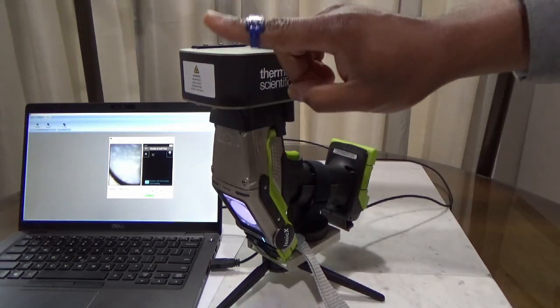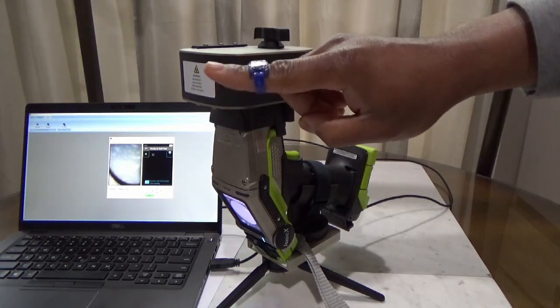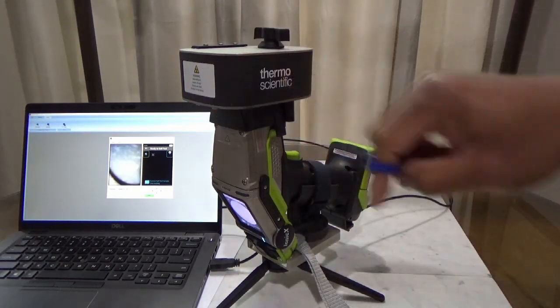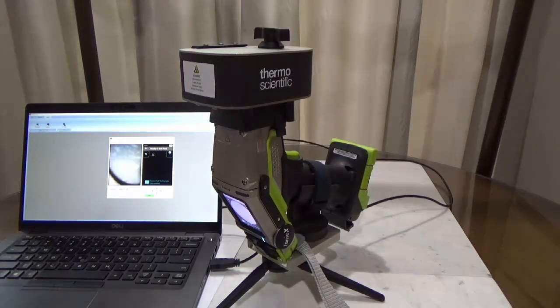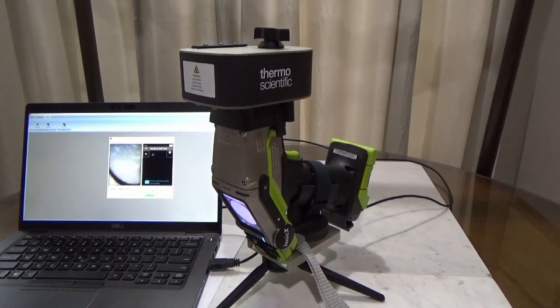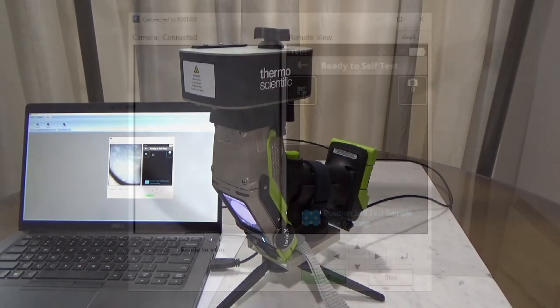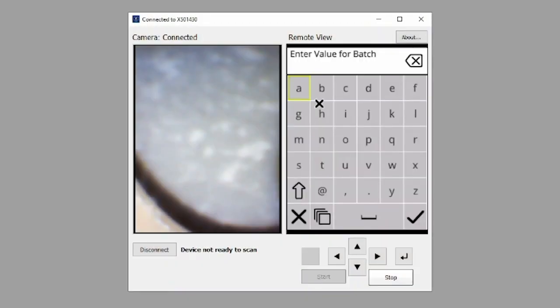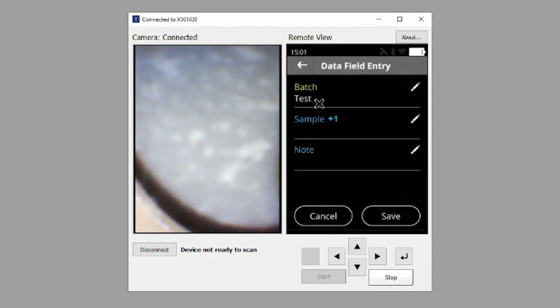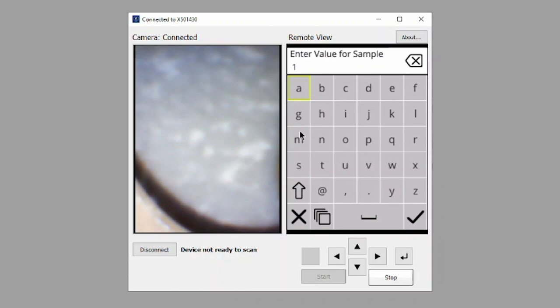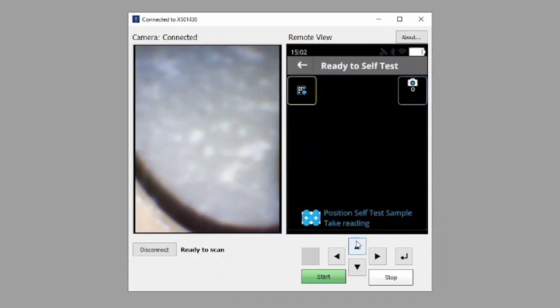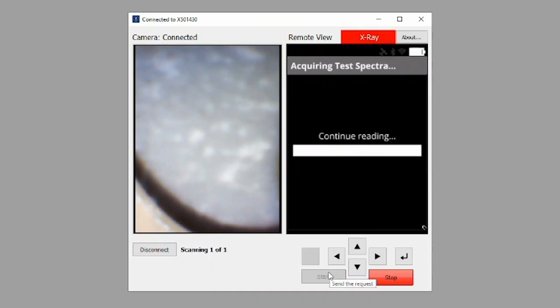Note that I am also wearing a suitable radiation monitoring accessory. Be sure to comply with your site requirements when using instrumentation with X-ray emissions. Click the icon in the top left of the screen to enter in batch and sample information. For this demonstration, I am using a physical keyboard to type my batch information. Select Save. Click the green Start button to begin the analysis.